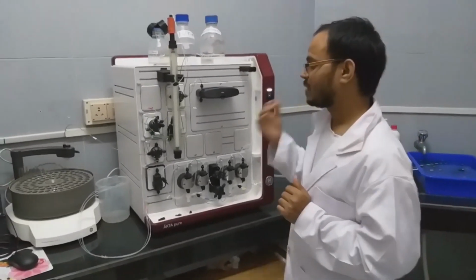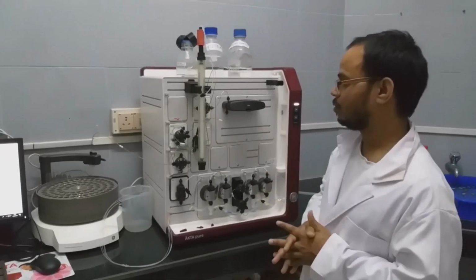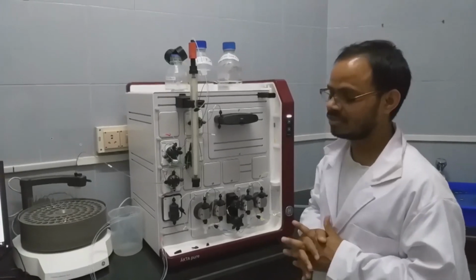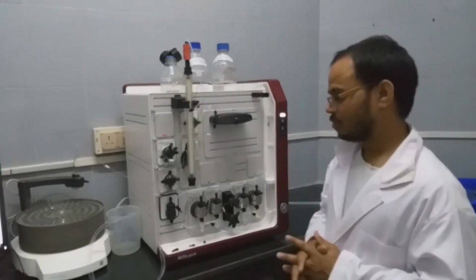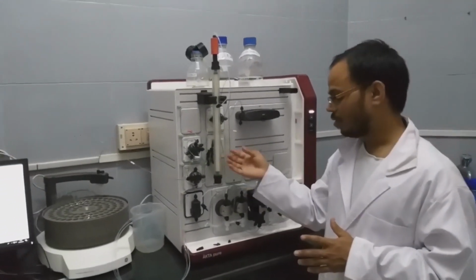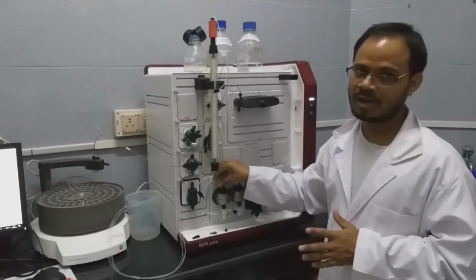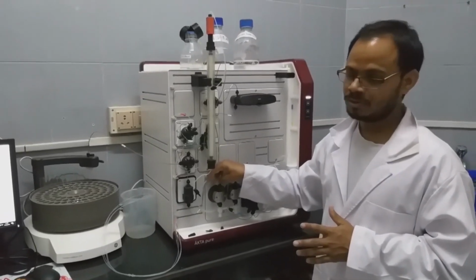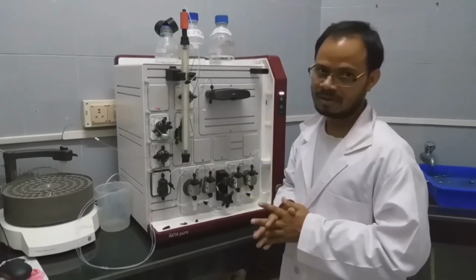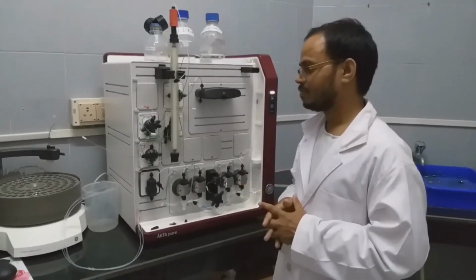So we have washed already, the system has already been washed. So now what we will do, we will connect the column. Here, precautions need to be taken while connecting this. If you have any air bubbles in these loops or the piping system, they will directly enter the column, which will destroy it. So to prevent that, we have to make sure all the loops and pumps got washed thoroughly, and then we will connect in running condition.